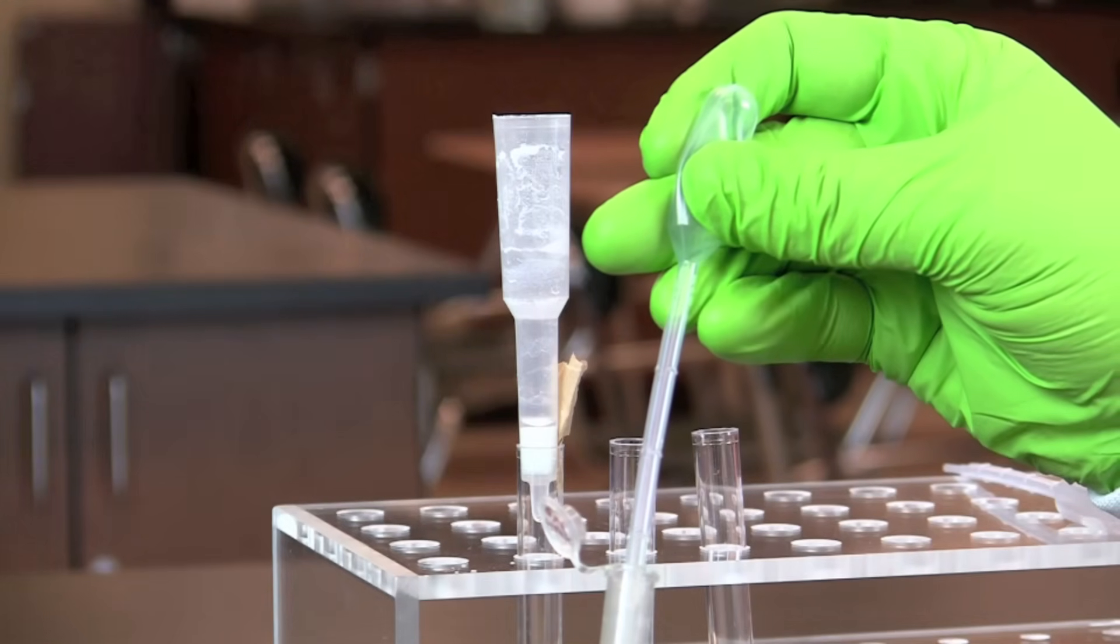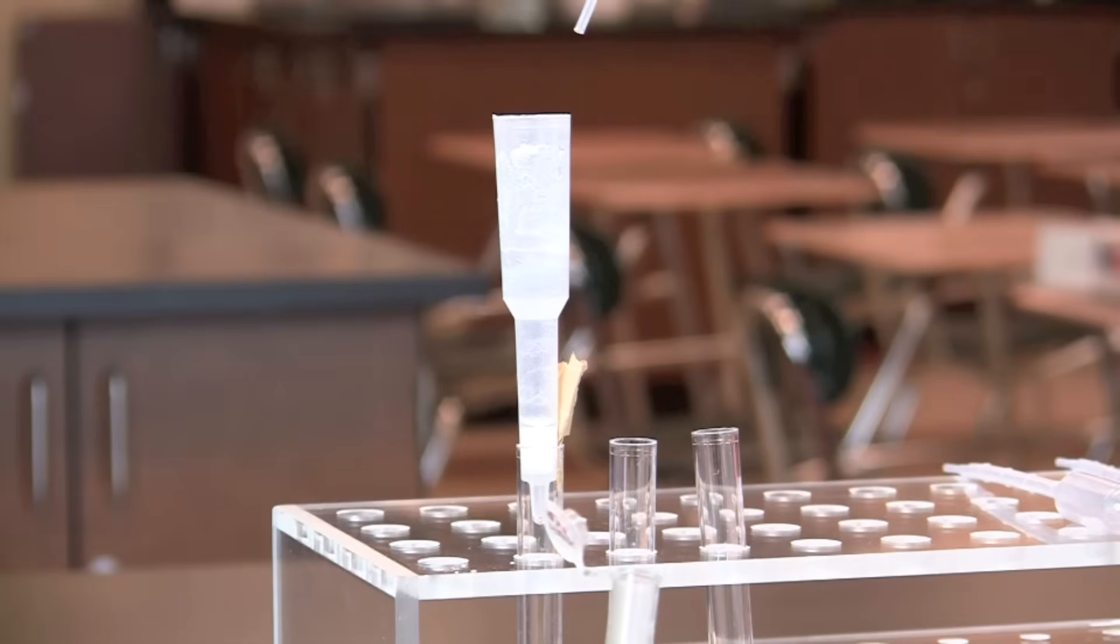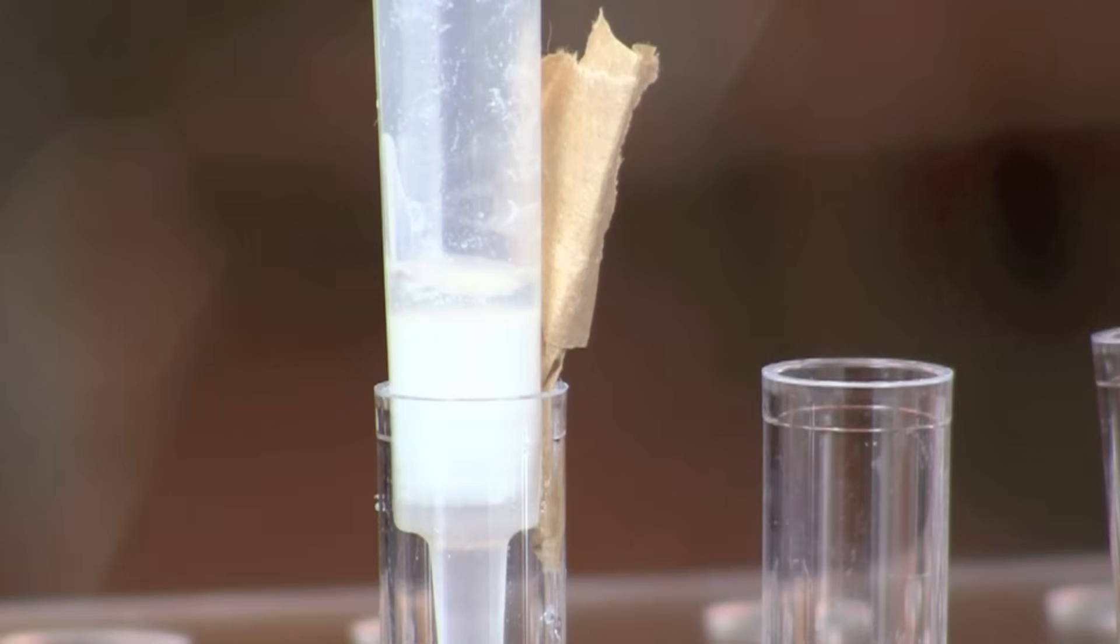Next, pipette 250 microliters of bacterial lysate with GFP to the column. Insert the pipette as far into the column as possible without touching the resin, and pipette slowly and gently to avoid any disturbance of the column bed.